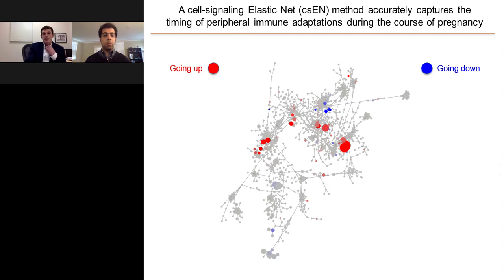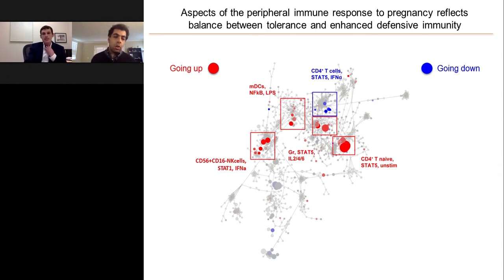Yeah, and what's interesting in this representation of these immune features overlaid on the overall immune networks is that we realize that they belong to various communities of features that can be characterized based on their most important attributes. And this can be a cell type or signaling pathways.